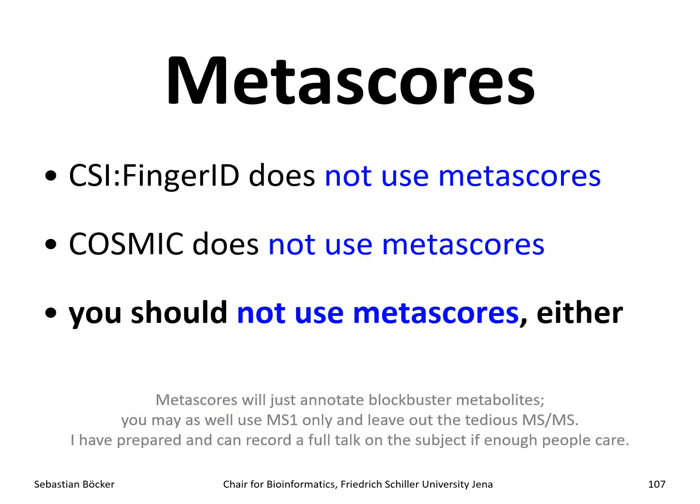One last word, because I always wanted to make a talk about that and I never really did. I should do that at some stage. I want to tell you that CSI FingerID throughout all the evaluations that we did is not using metascores. Metascores are scores that are using things like citation frequencies, or production volume. They have nothing to do with metadata, by the way.